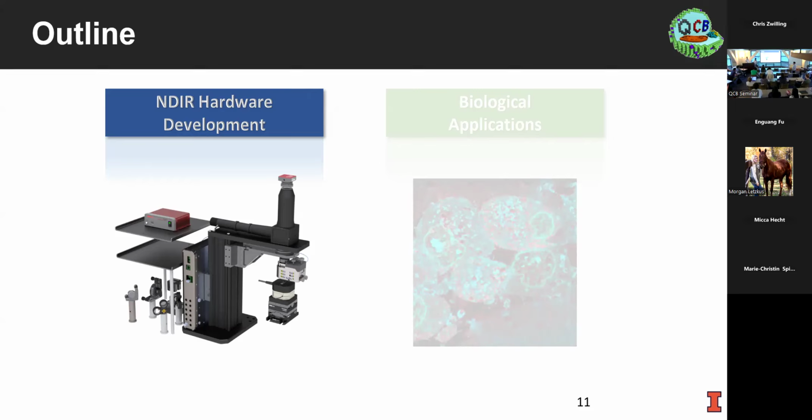I guess related to that is how well do you register different images at different bands? That's a good question. I'll actually go through that, but I have a custom non-rigid image registration code that registers the height images, which are all in theory the exact same measurement. So we register those, and then we determine the deformation fields from that to remap the IR components.